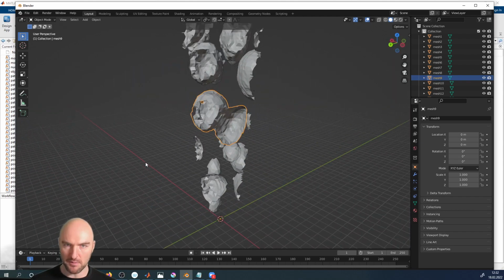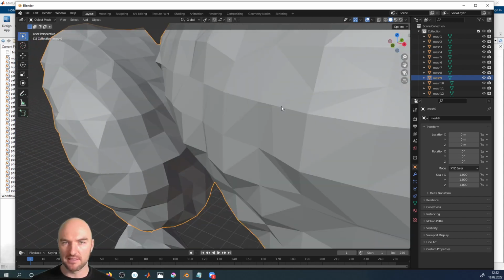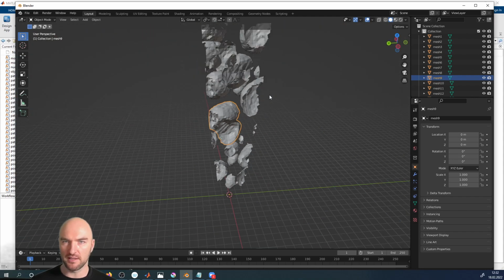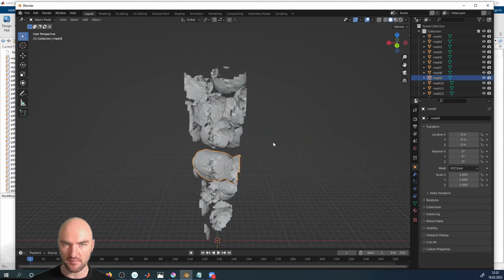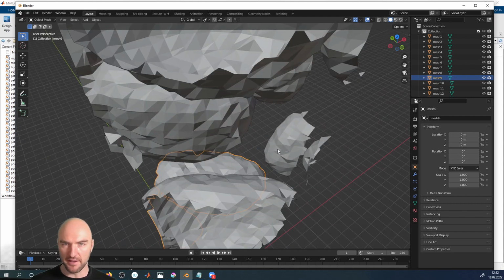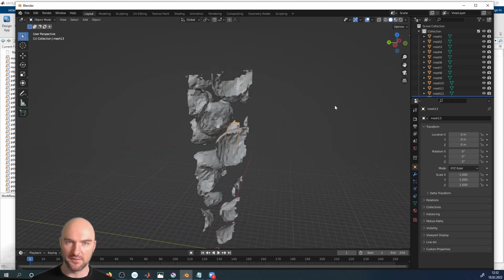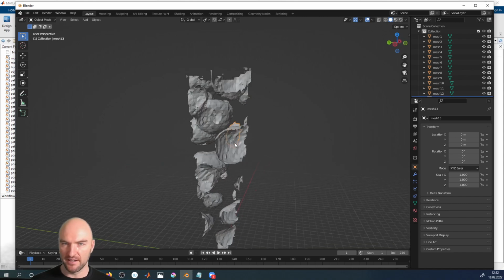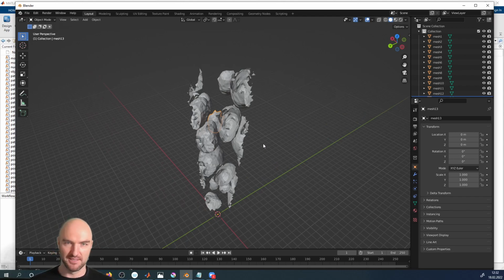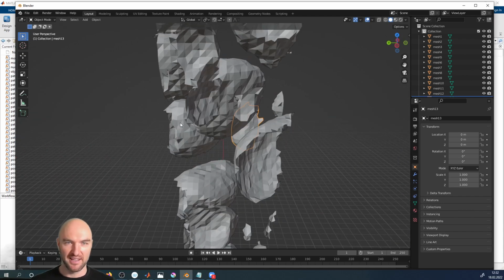We can edit them. We can make them prettier. For example, we have some weird pinch point in here, because later on I will explain what the topological problem is that we have with isosurfaces sometimes in analysis. I can delete some. I can do whatever funky thing I want with our isosurfaces in here. Or for example, if I've got a nice and closed up surface, I could export that or 3D print that. That's something that's always very cool, if you've got cool data, to hold it in your hand.